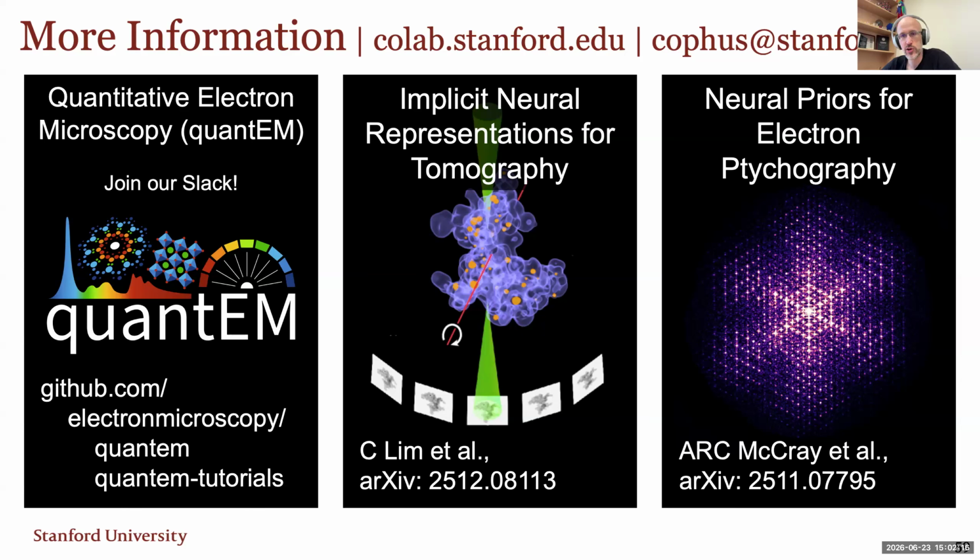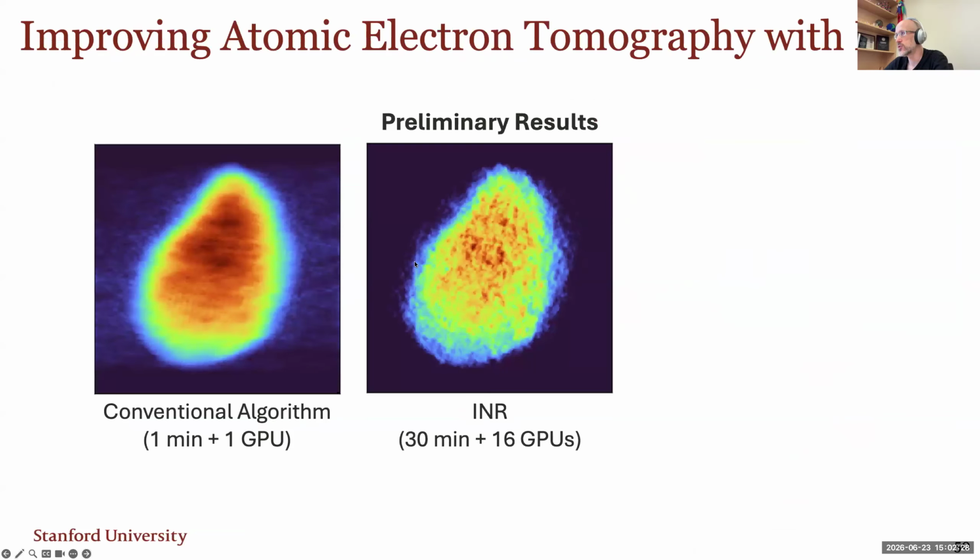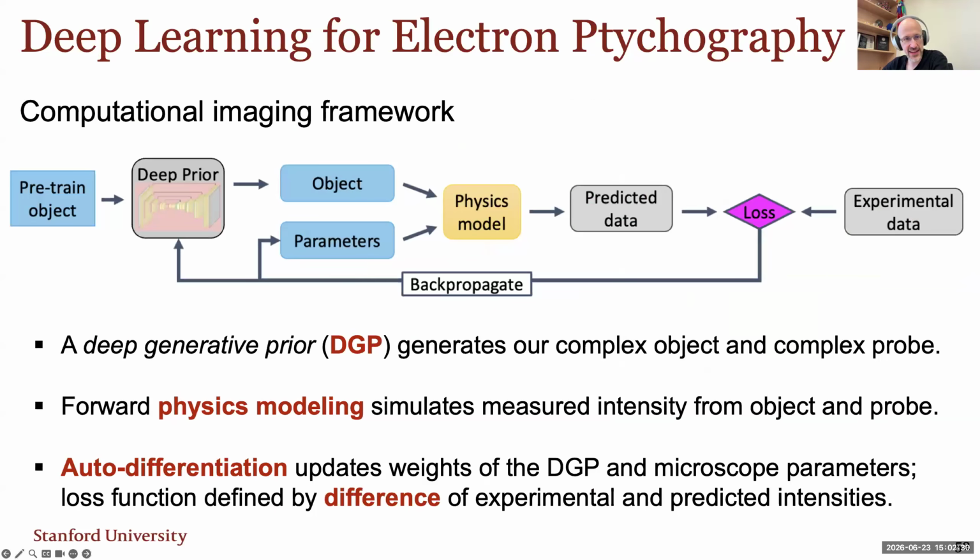And so you have to take what people are doing already. So use the existing ShelX reconstruction, but instead of, basically, I guess I could just flip back very quickly. So in this case right here, it's exactly like what you would imagine. You're using a physics model, this ShelX forward model. The object is either your list of diffraction spots, HKLs, in which case you use a graph representation, or the pixel or voxel intensities, in which case you use the voxel representation.